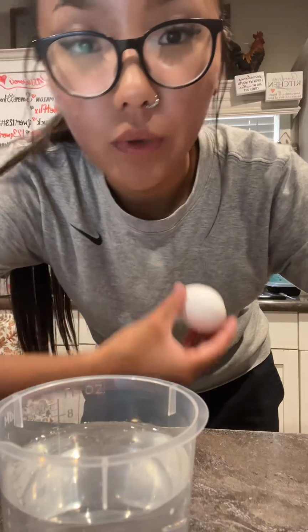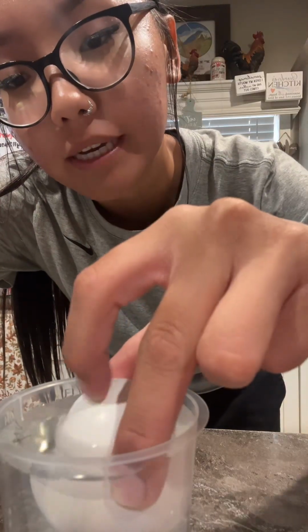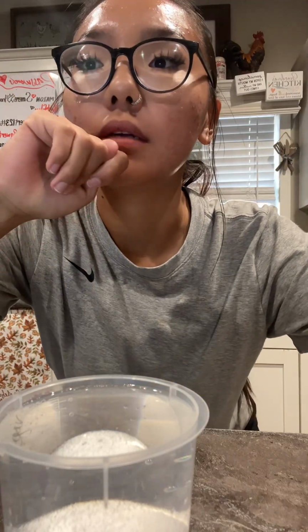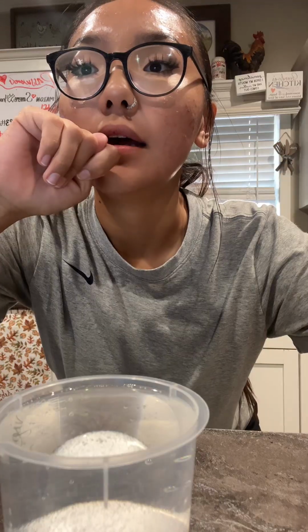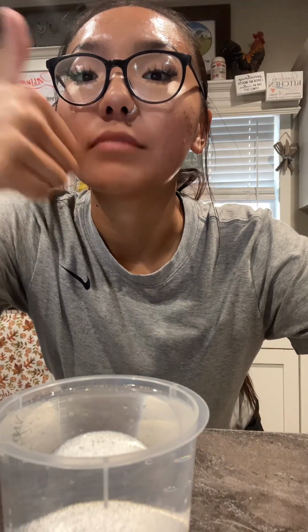There we go, 200. We are now going to put this egg into the vinegar and make sure it covers the whole egg. There we go. We will now let this egg sit till tomorrow and allow it to stand for 24 hours. So yeah, we'll see you guys tomorrow.